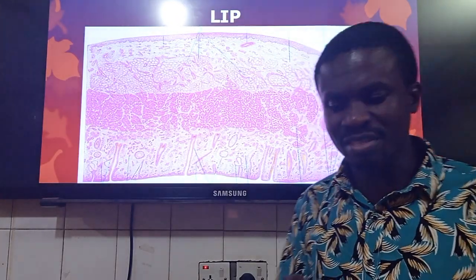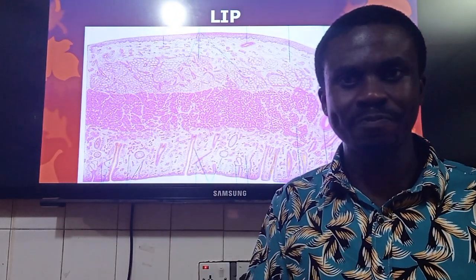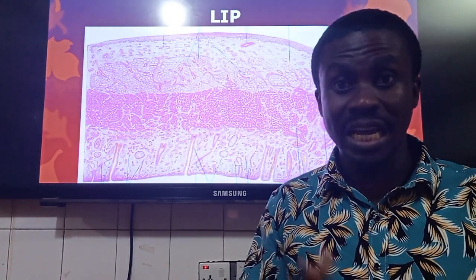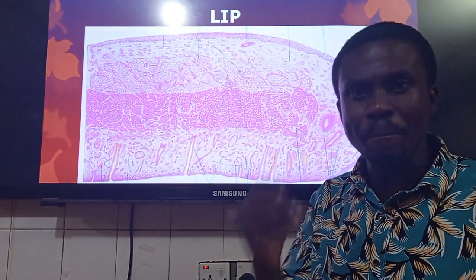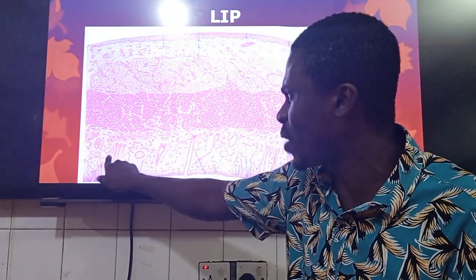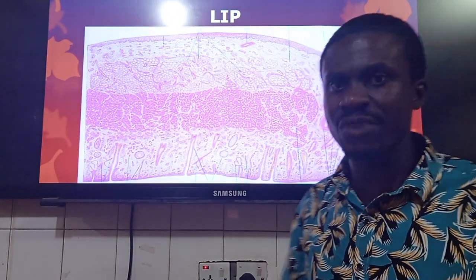And my friends, one thing we are aware of is that associated with the hair follicles is a muscle which, upon contraction, will cause the hair shaft to stand erect, almost 90 degrees with the surface of the skin. We are talking about the erector pili muscle, which is exclusively made up of smooth muscle fibers. So, my friends, these are the ones I'm talking about. This one, for instance, these are what we call the erector pili muscles, the smooth muscles associated with the hair follicles.